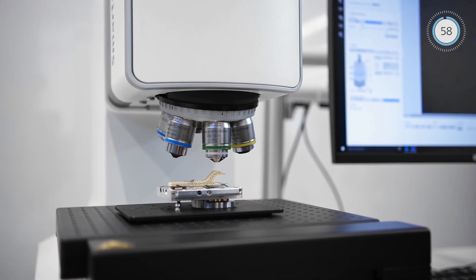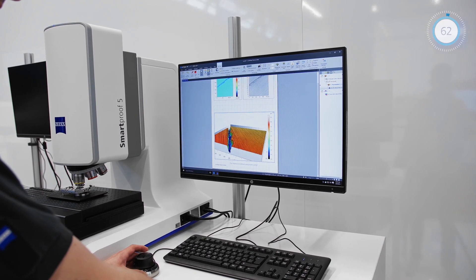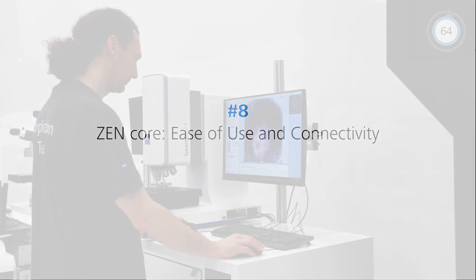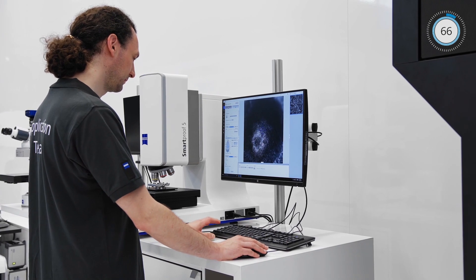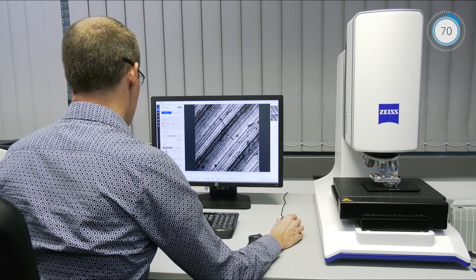Automation ensures consistent results and increased efficiency, independent of user experience. Harness the power of data compatibility in connected labs and easy operation even for novice users.